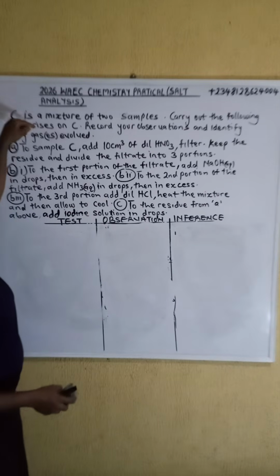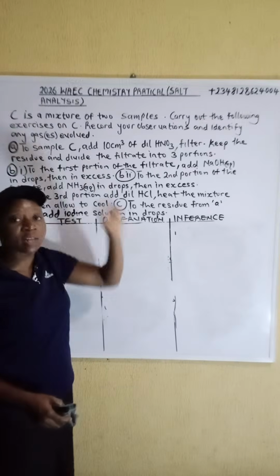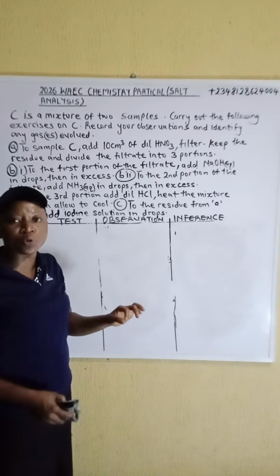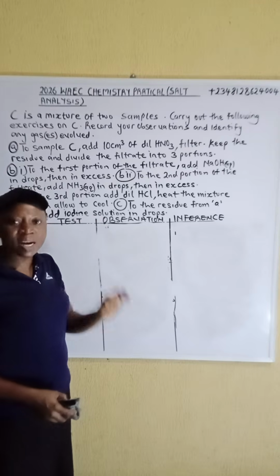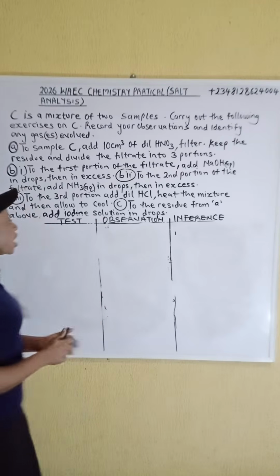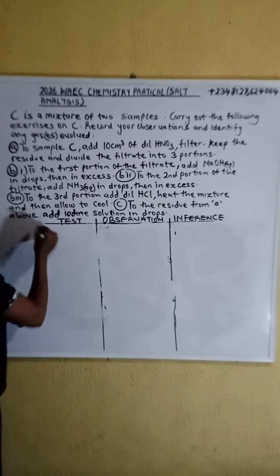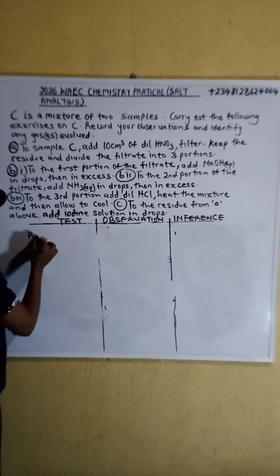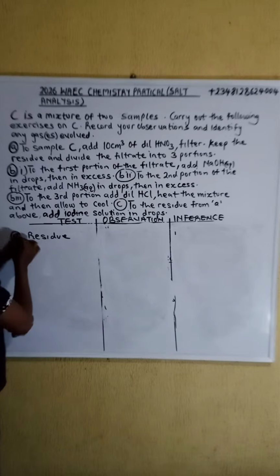Don't forget that the starch remains insoluble in nitric acid. So our residue contains starch. So we are going to say that residue.